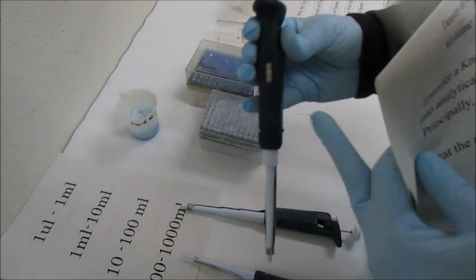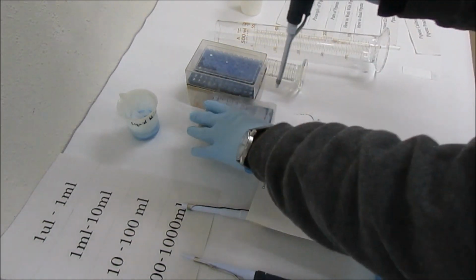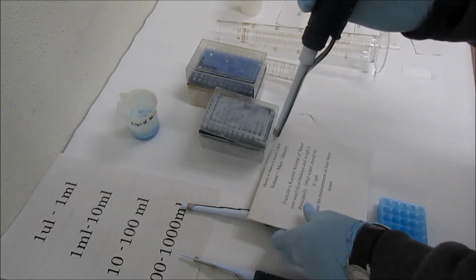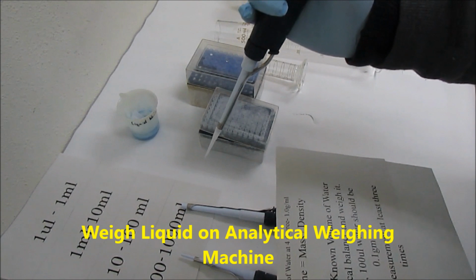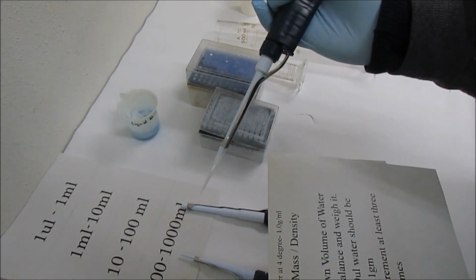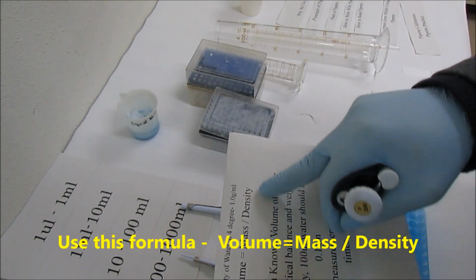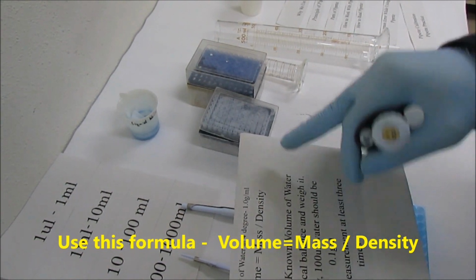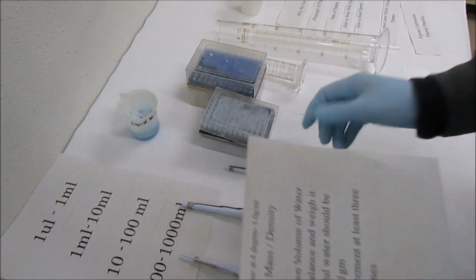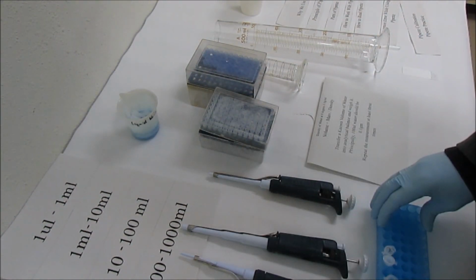So just select a pipette and transfer a known volume. Suppose you want to transfer 100 microliter. I set the pipette, take the liquid water and weigh it on the analytical balance, right? If my pipette is working fine, 100 microliter of water should be about 0.1 gram, as per the formula volume equals mass per density. Very simple to do, right? You can repeat the measurement at least 3 times to know whether your pipette is working fine or not.